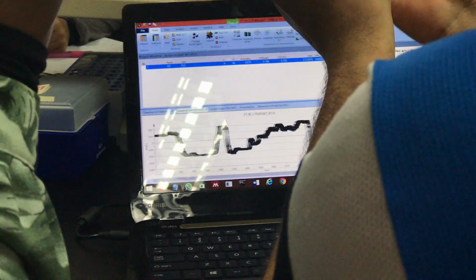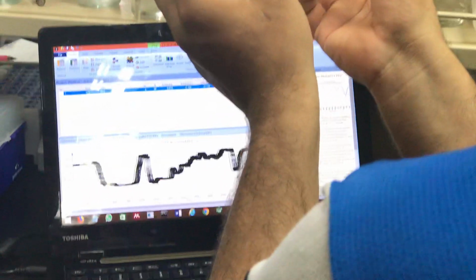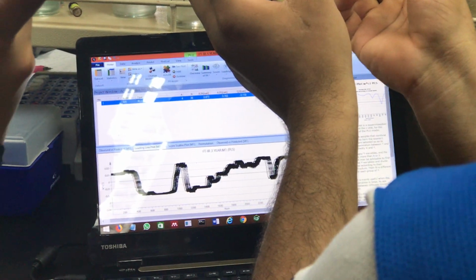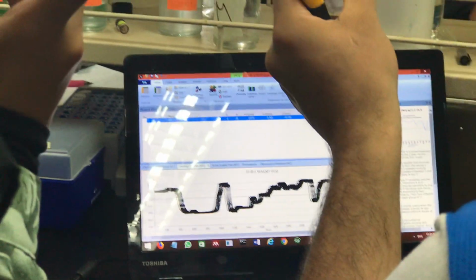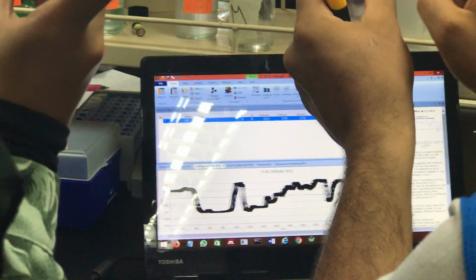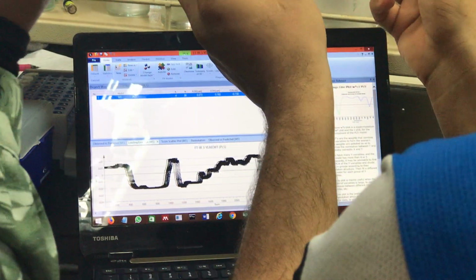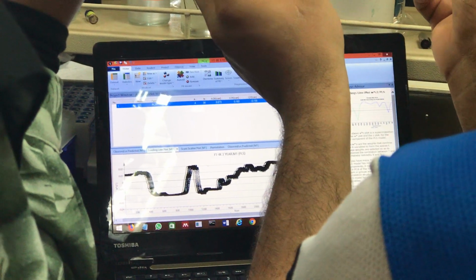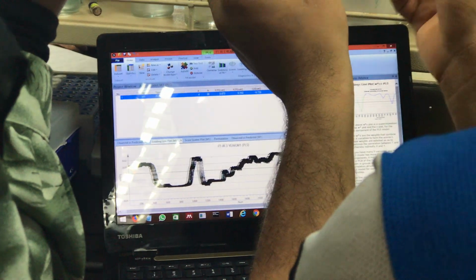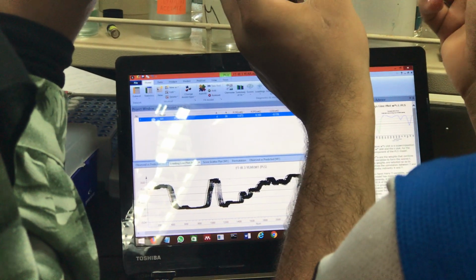when I tell it to give me the difference between the colors, that means I help the software. Or like character, I help the software. But if in general, I tell it to give me the difference between these things in general, it will maybe talk about the color, the size, everything.